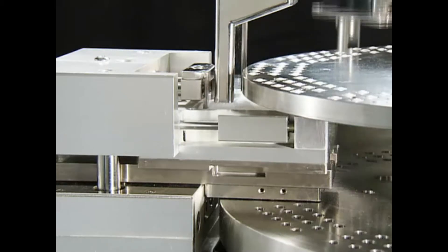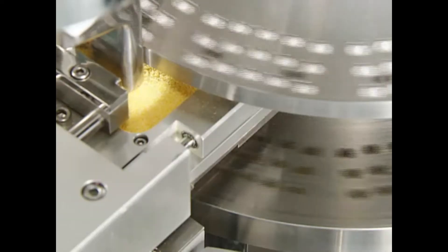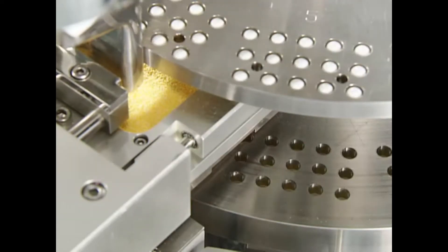It is possible to fill various granule combinations including time release, gastrointestinal solution and uneven granule compositions.